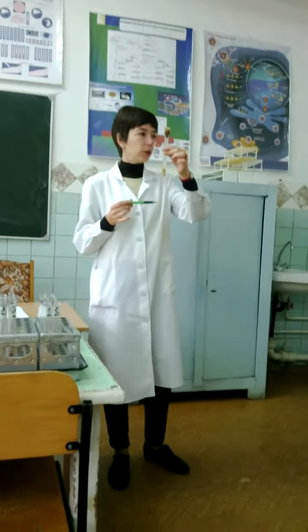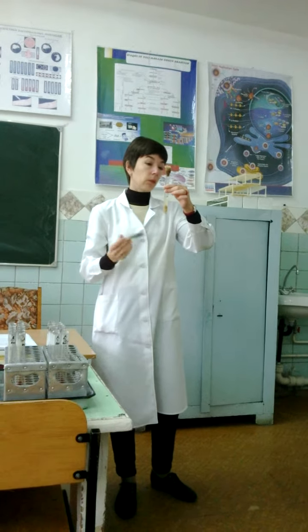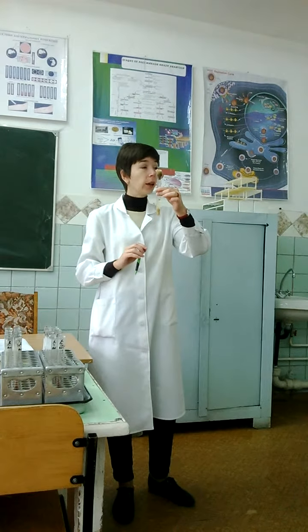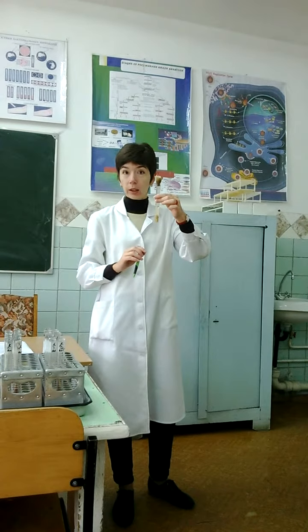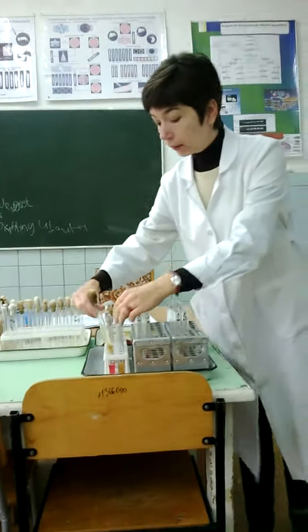Before cultivation, this media is heated to remove oxygen, then covered with Vaseline oil to stop oxygen absorption. As a result, anaerobic conditions form in the middle. What anaerobic bacteria do we study? Clostridium tetani, botulinum, Clostridium perfringens. So please study the diagnosis for Clostridium.